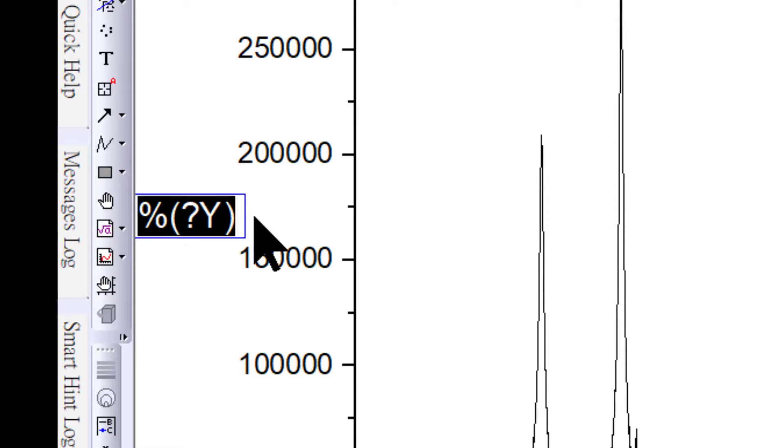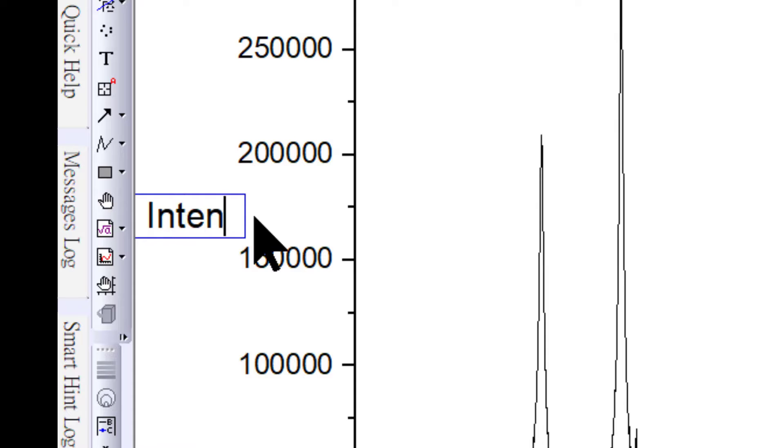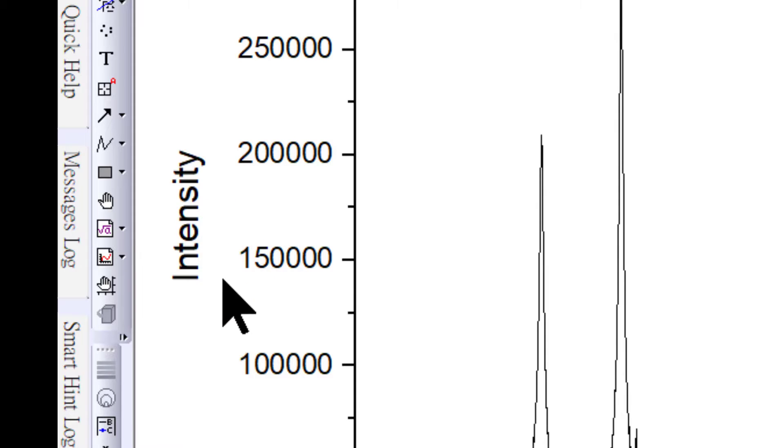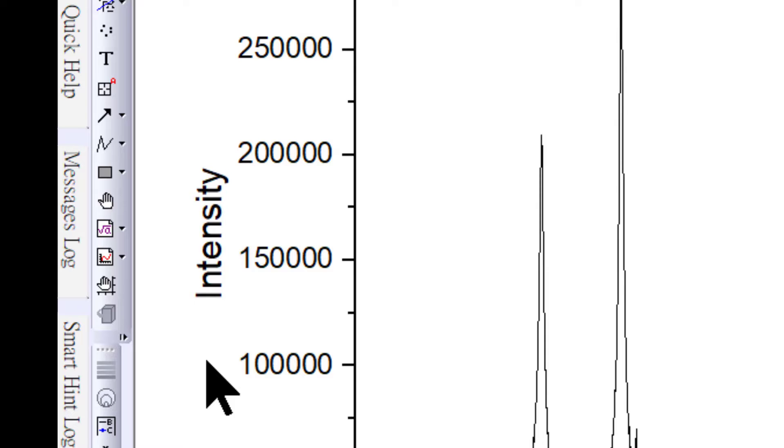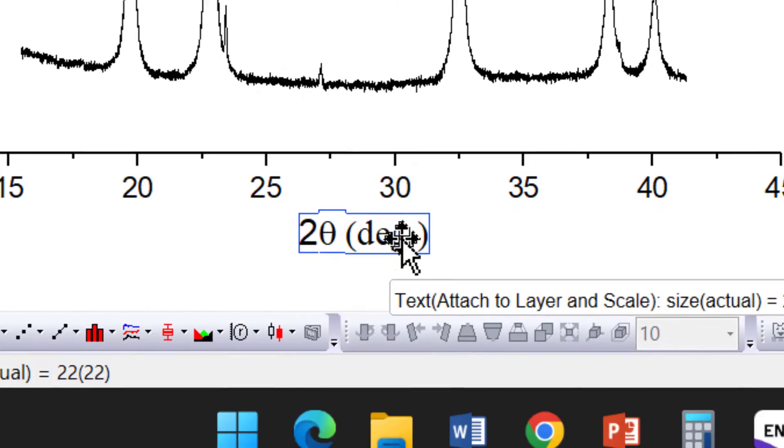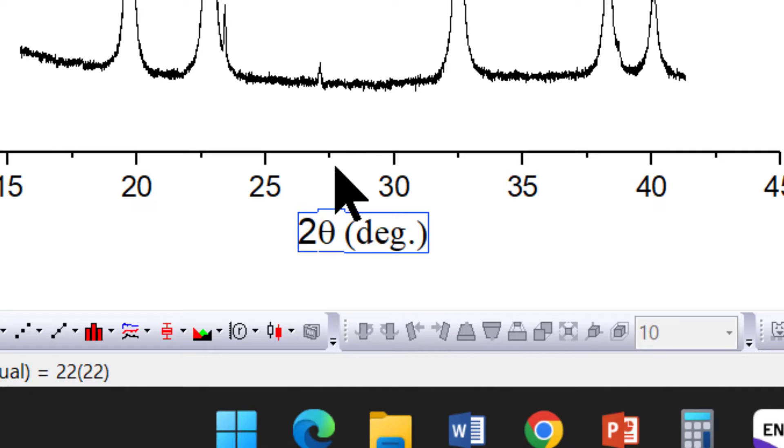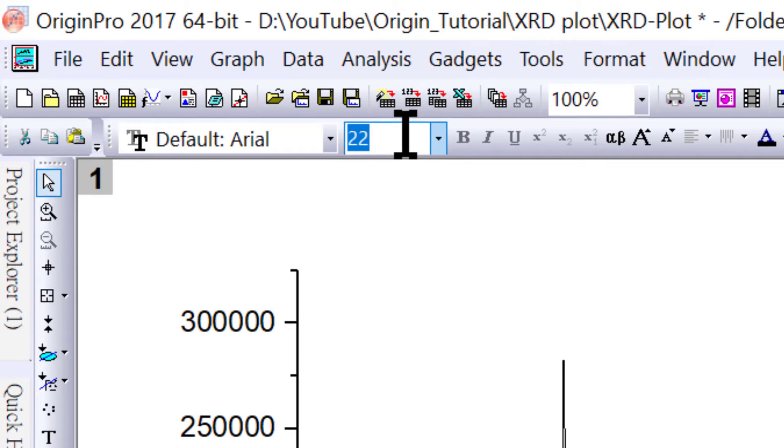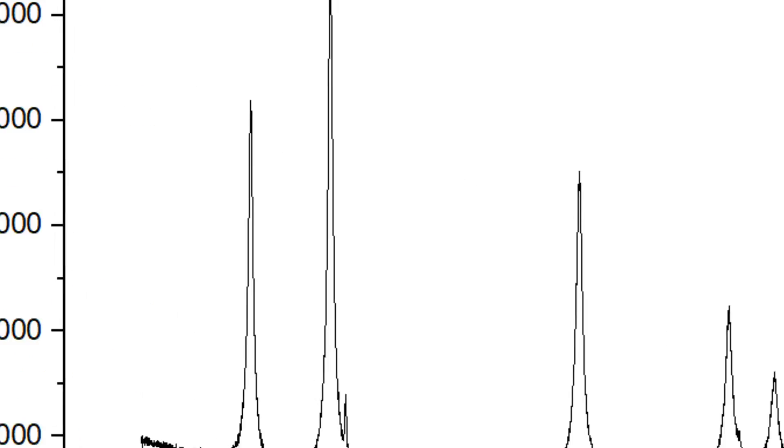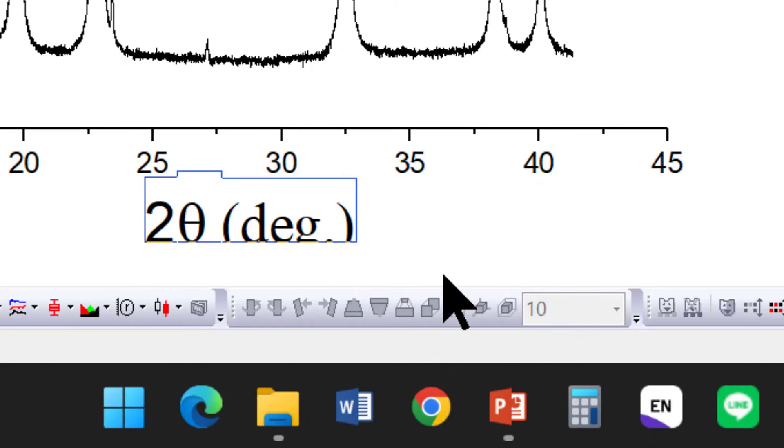For the y-axis, type intensity. If you want to change the size, click on the text and select the size. I would like to select 36 font size.